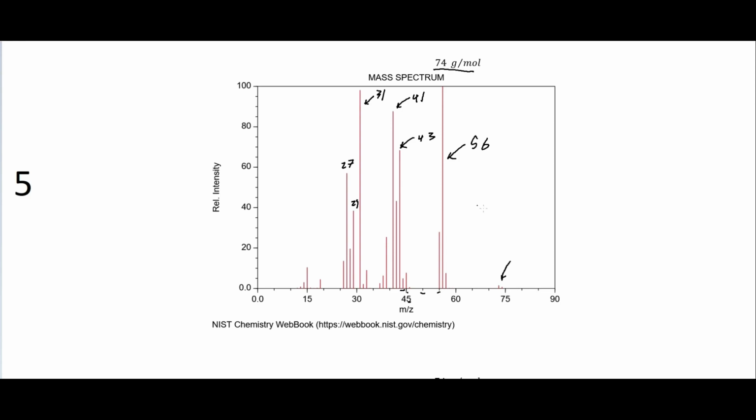And so we have here this 56, which, like I said, looks kind of like a butyl group. So that would be something that looks like this. And so we could maybe think of this as maybe having the positive right there, or maybe right there. And maybe we're missing something else on here, which might tell us something as well.